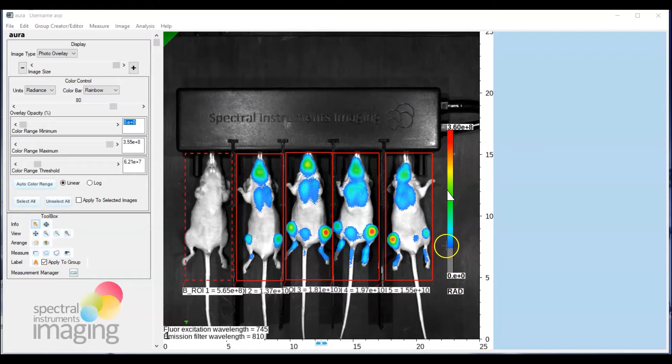So we're simply going to go ahead, take the threshold value and apply it to the minimum of the calibration bar, so the entire range of the calibration bar is nicely used in defining the presented data.